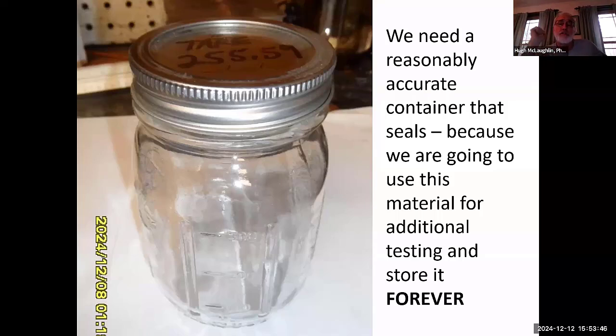So the guy said it's less than 5% ash. You measure this material, it is 30% ash. Well, now you've got data to go back and ask for some settlement or something. He's not going to take the load of char back, but you might be able to get to some parity on what was promised, what was sold, delivered, and paid for.